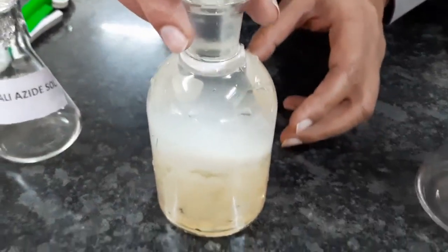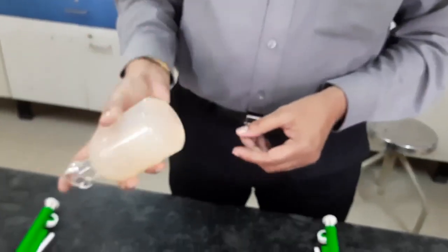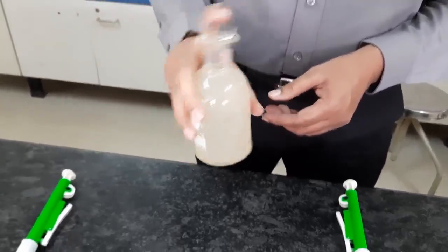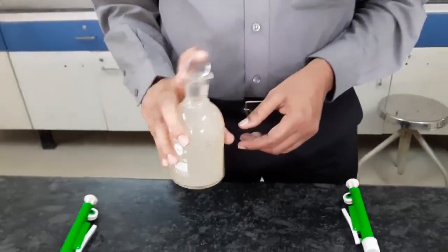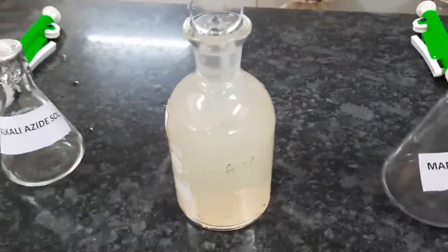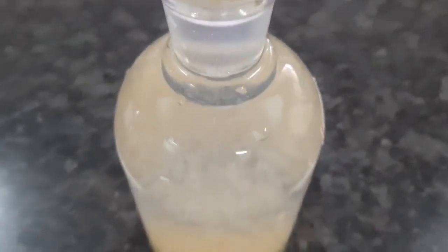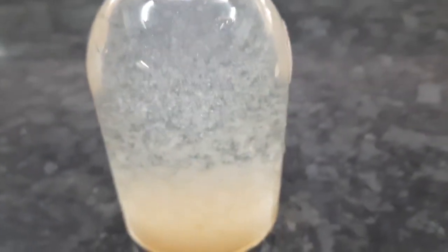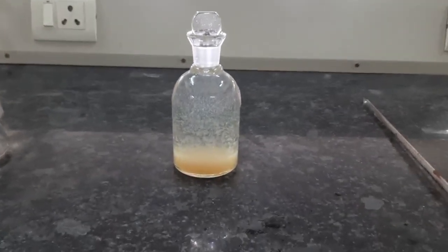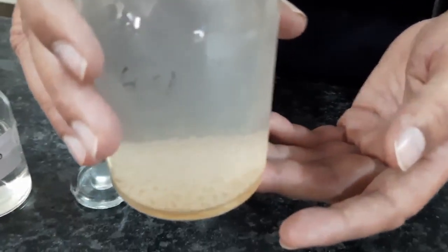Once the 2 reagents are added to the BOD bottle, it has to be gently mixed to see that the 2 solutions we have added are mixed, and then it has to be kept in the dark or at the same place for 20 minutes for the precipitate to settle down. See, you can observe the precipitate has settled down.